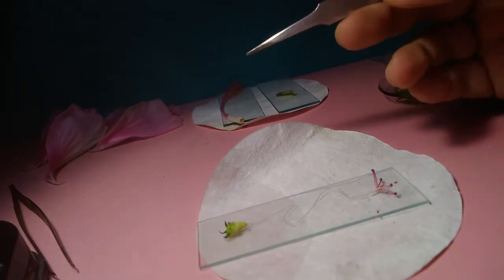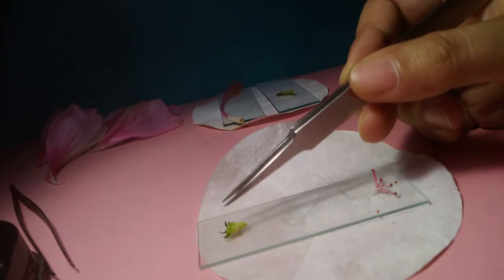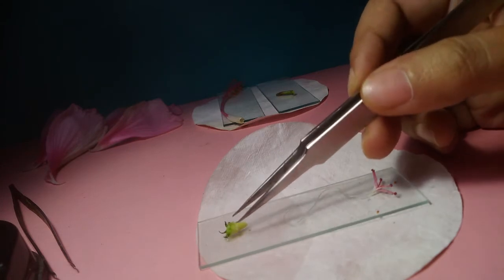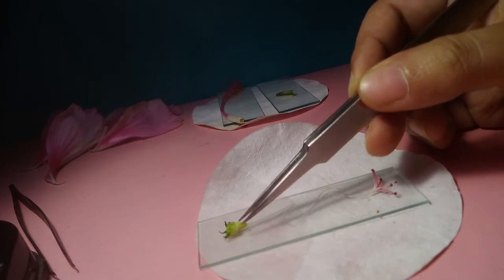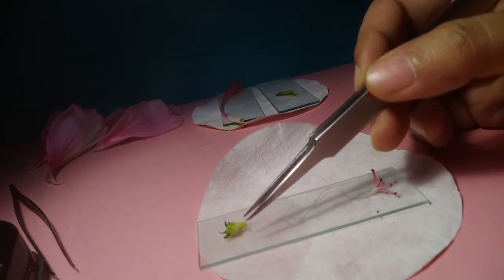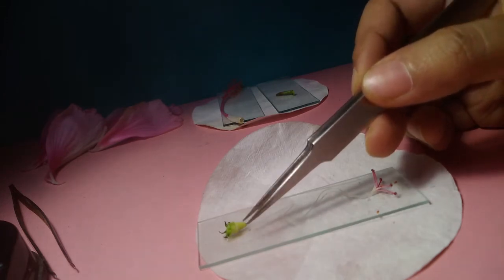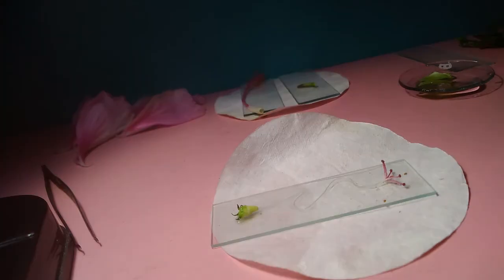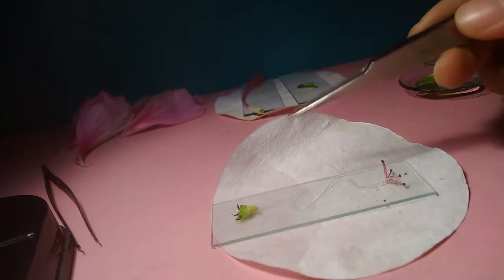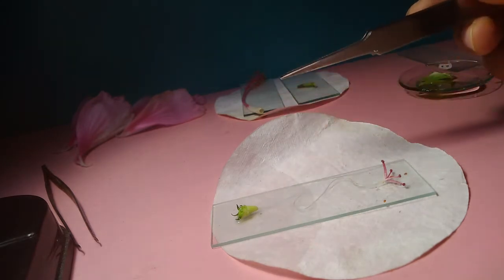I think now it is easier for you to understand that this is the ovary and these parts are the epicalyx, okay, and the sepals were also arising from here only. So we have our ovary above our sepals, petals and the epicalyx. That is why this is an example of superior ovary, and this condition is known as hypogynous condition or hypogynous ovary, superior ovary or hypogynous ovary.